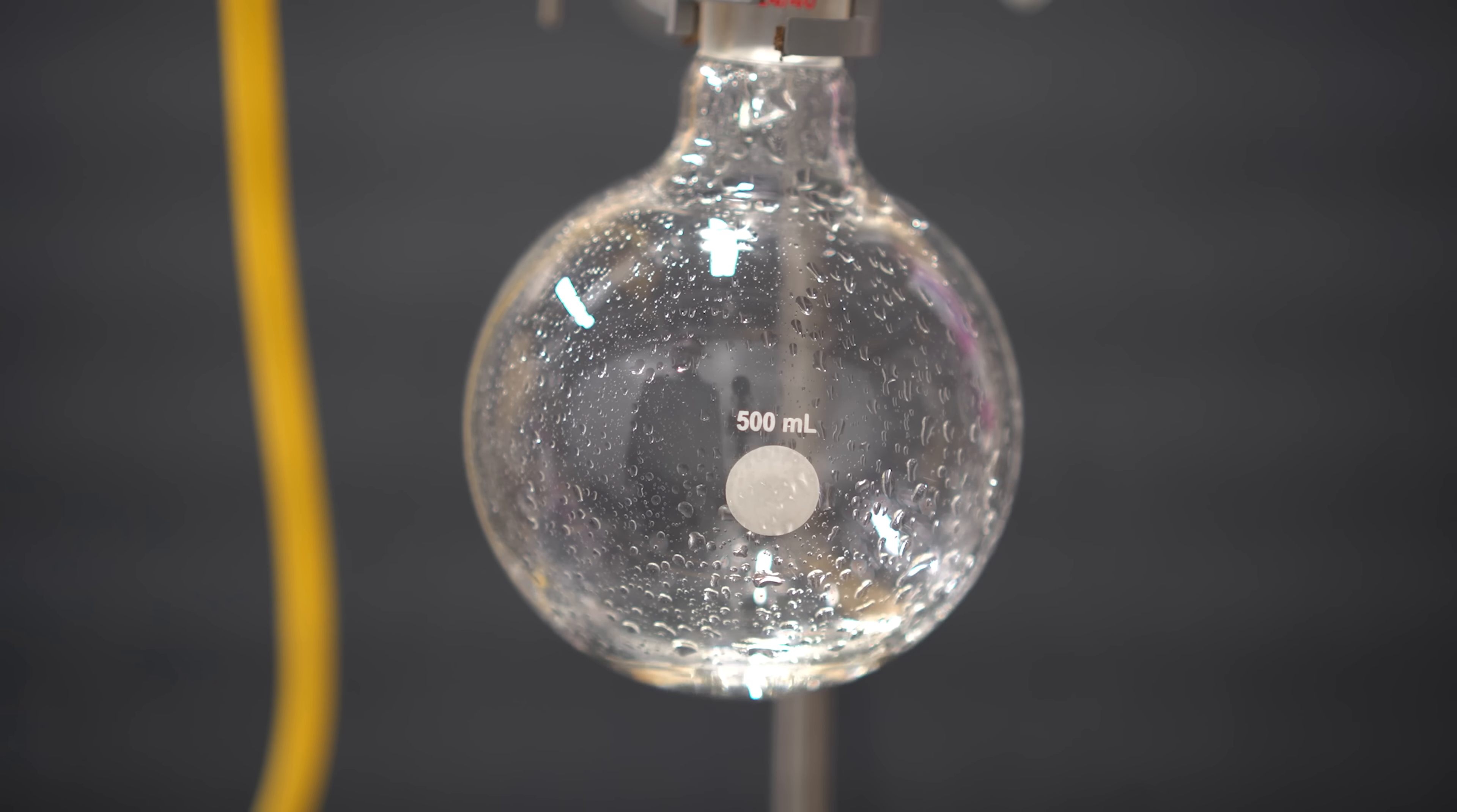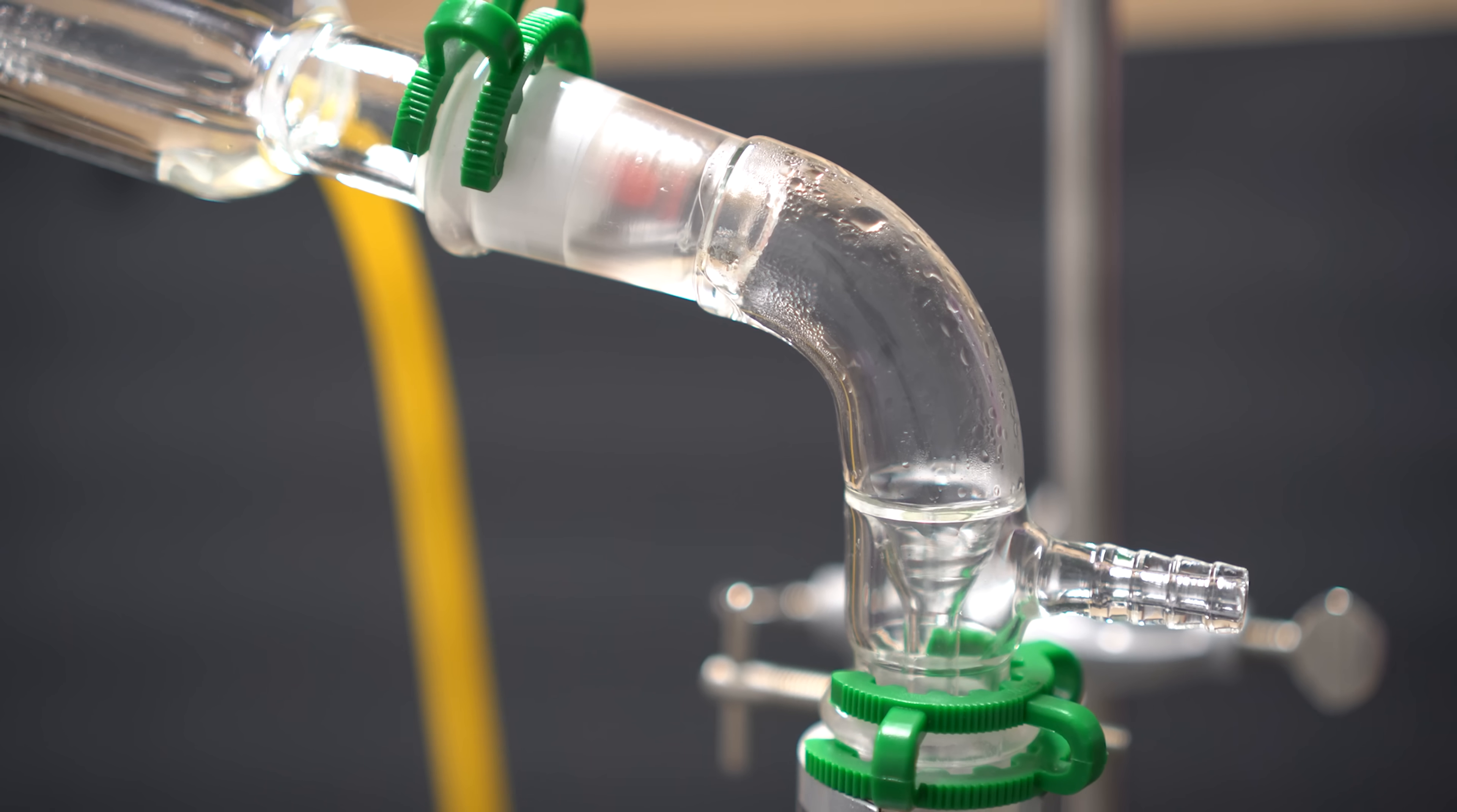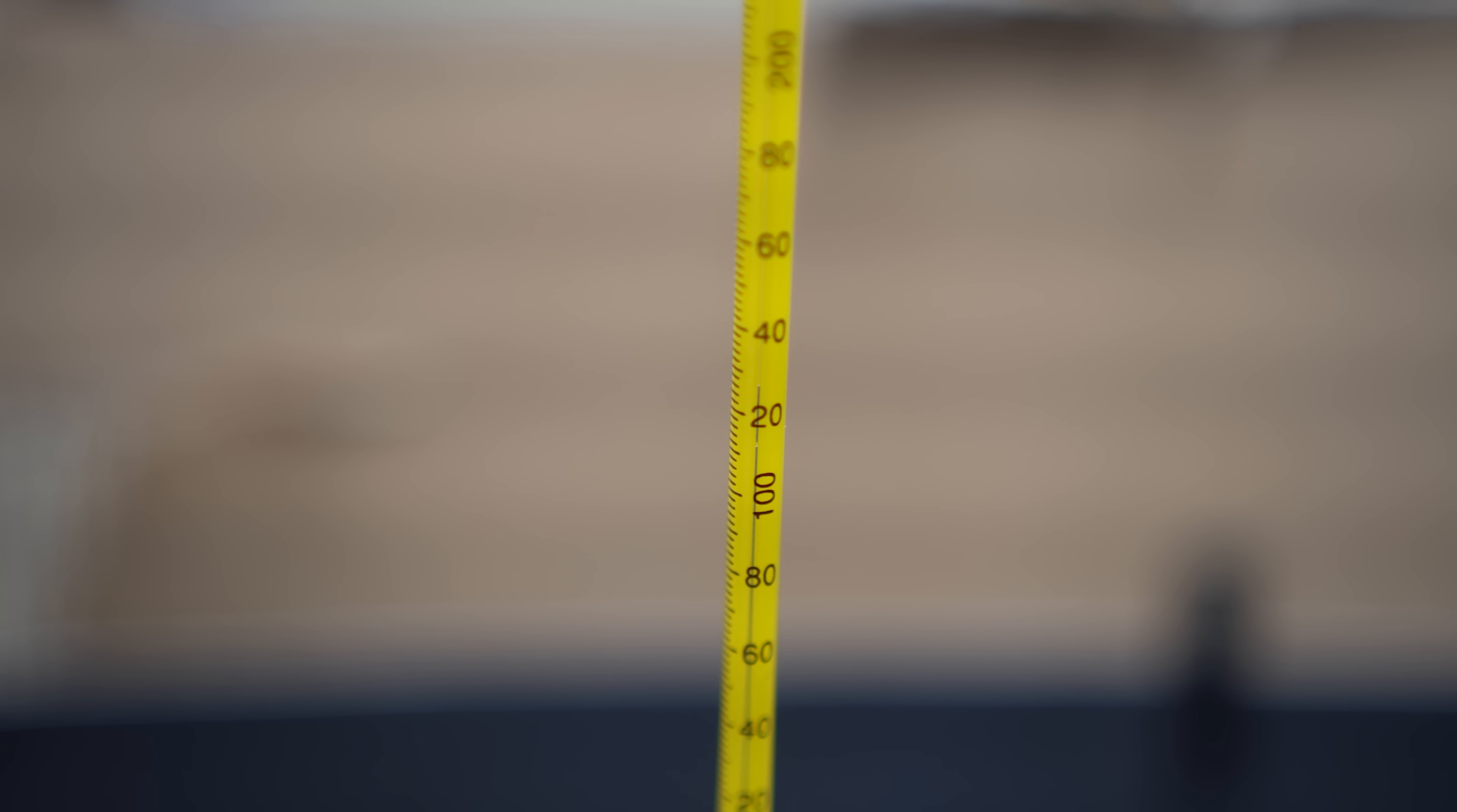Now, everything that we collect should be pretty close to the azeotropic hydrobromic acid, and we're definitely going to keep this portion. Now, I did not set up a sodium thiosulfate trap for this run, however, I should have. As the solution started to boil down, the elemental bromine that was dissolved in there did start to accumulate and be more concentrated, so that was kind of a worry.